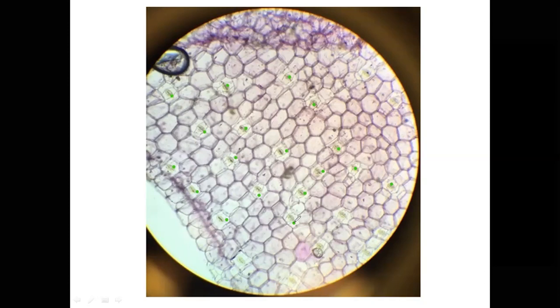against the marking scheme. And that's why I said those nitty-gritties can be very costly if you don't play by the rules. Examiner akisema utumie low power and you don't obey or you don't stick to that, you get your own figures. And therefore, during marking, you fail. Utaanguka tu, not because it was difficult, but because you never played by the rules. Like now, this is low power, of course. Let's see how it would appear.